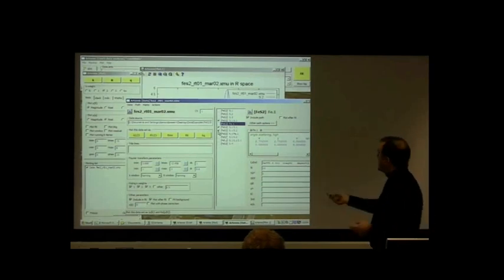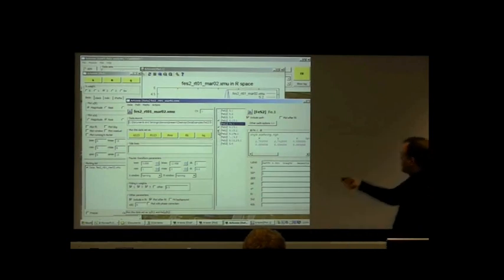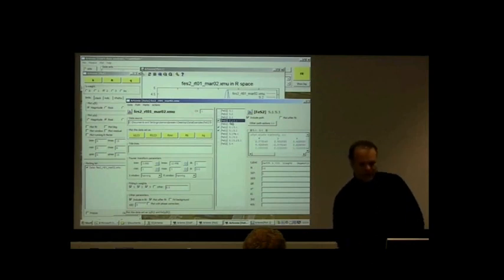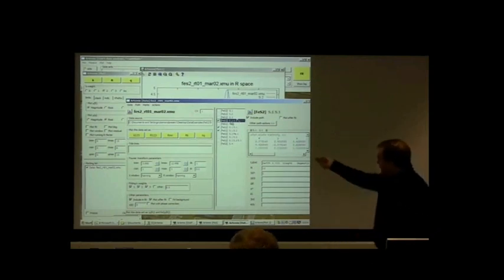So the first thing I want to do is examine, in this sort of approximate way, how each of these things are going to contribute. And so we'll do them in groups of three. We'll do the first three and then the second three. What we did before was click on each of them and click this button, click, click, click.